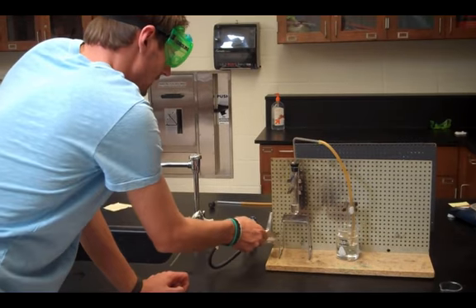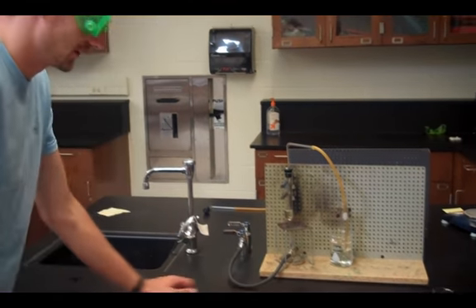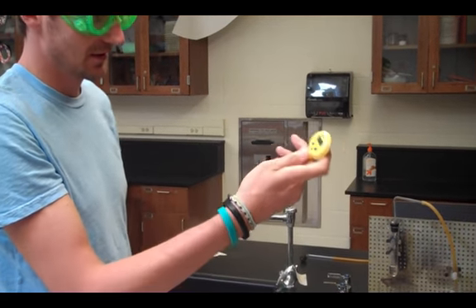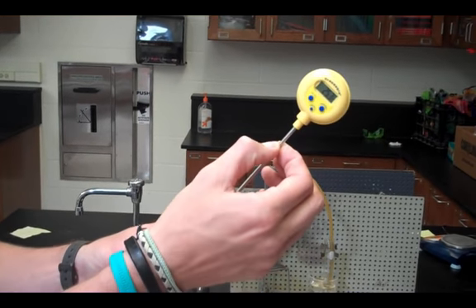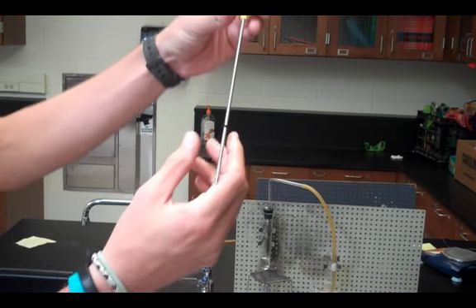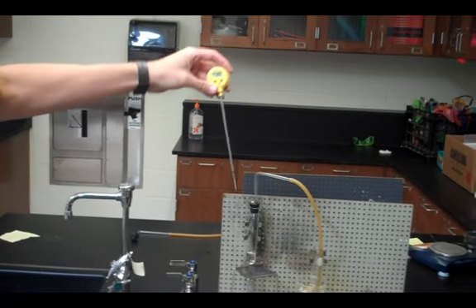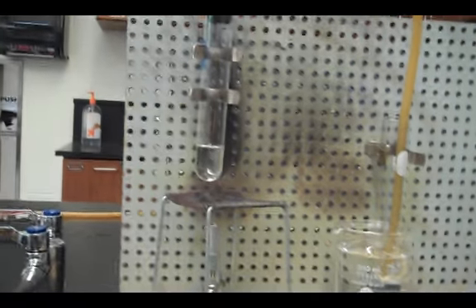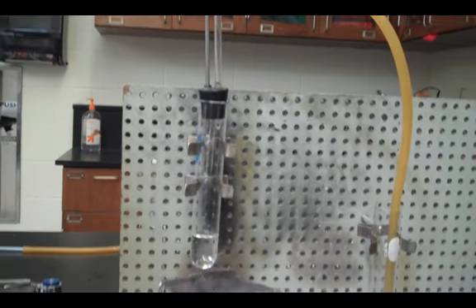Make sure your Bunsen burner is underneath the stand. You're going to want to take your thermometer and make sure it's on Celsius. And on your thermometer there's a rubber stopper here, so you can adjust the height of your thermometer in your test tube. You want your rubber stopper down towards the end of the thermometer. So when we put that in, there's only the tip of the thermometer right underneath the rubber stopper.